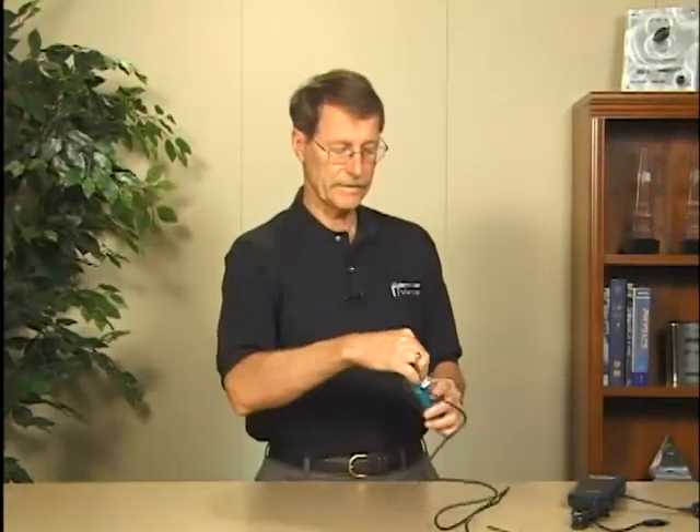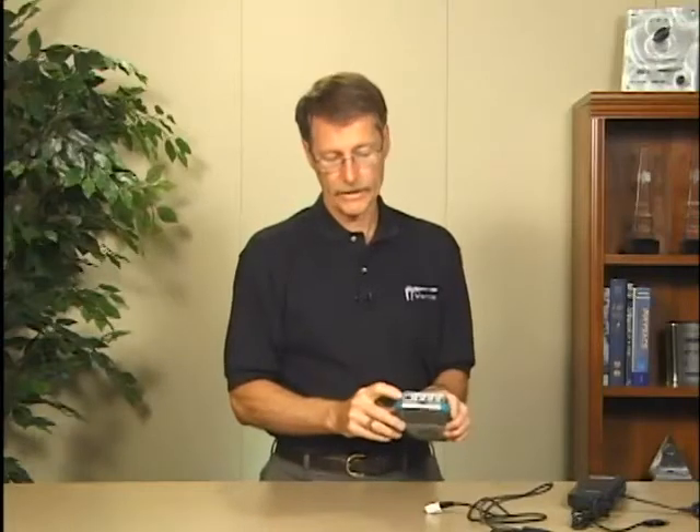We plug sensors in and it comes with a USB port here. That's for connection to either a USB flash drive, thumb drive, or to a printer. You can print directly from the LabQuest.